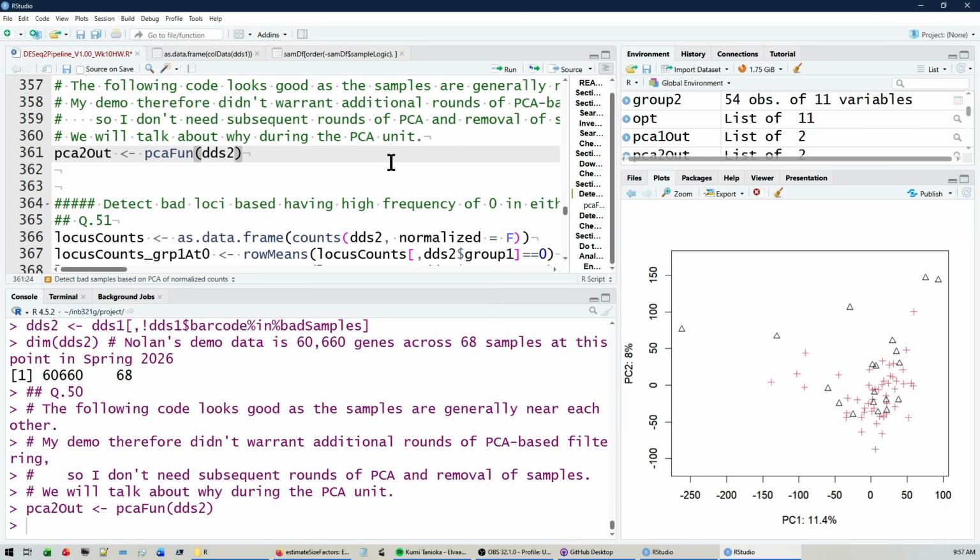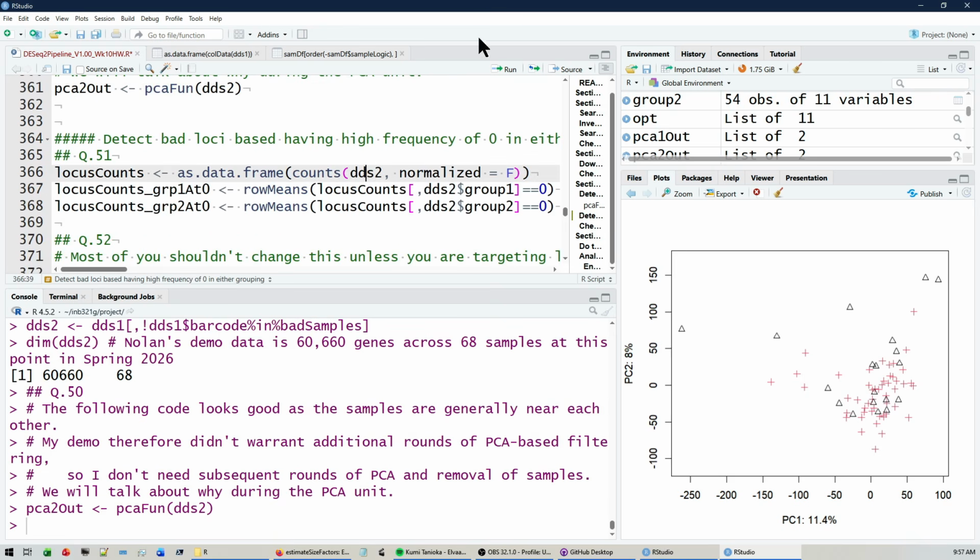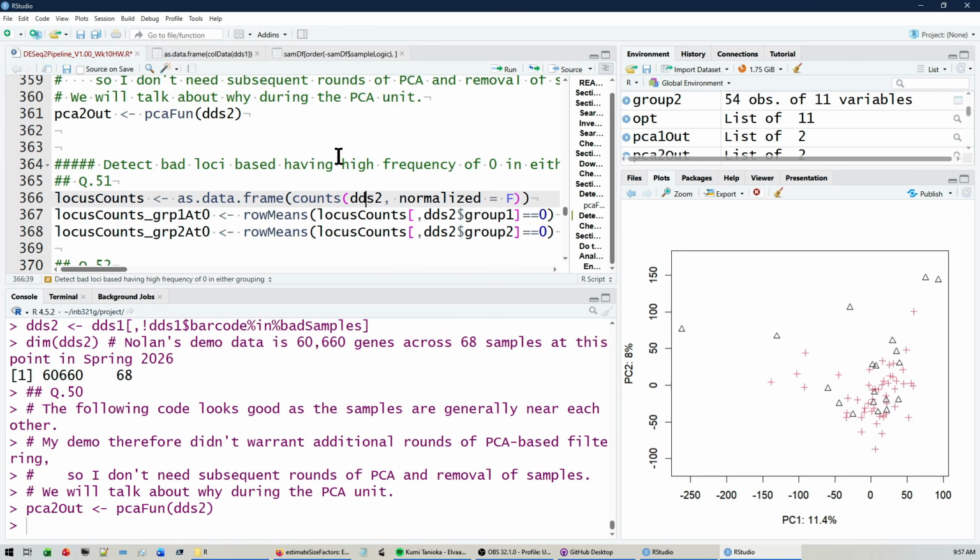That's kind of true in a lot of these collaborative reviewing systems. Sometimes you just say, that's close enough, that this is a decision that is based on imperfect data. So whether or not I should remove that is a decision based on kind of gut and instinct and experience. But I'm gonna say that's good, so I'm moving forward. And that moves us into the next filtering section.